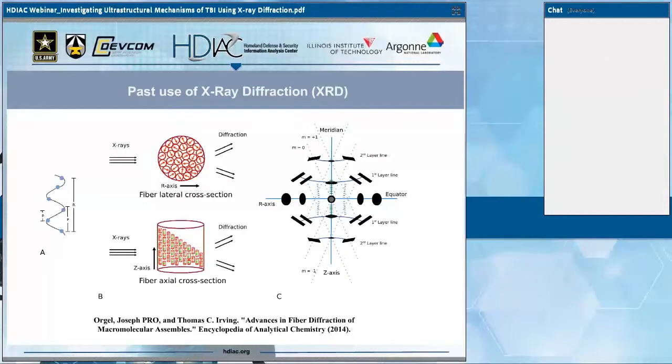However, if you look at that slide currently, the red image is giving a bit of an impression of what some of the complications are in terms of interpreting this kind of data. I've just talked about non-crystalline, but there also tend to be crystalline domains as well, and that diffraction will lie on top of each other. So that complicated schematic on the right is giving you an indication of different types of diffraction that are arising due to different orderings, if you like, within the tissue. And on top of all of that, those crystalline domains, those crystallites, will be orientated all the way around the clock in all sorts of orientations within what is usually a fiber or a fibrous organization.